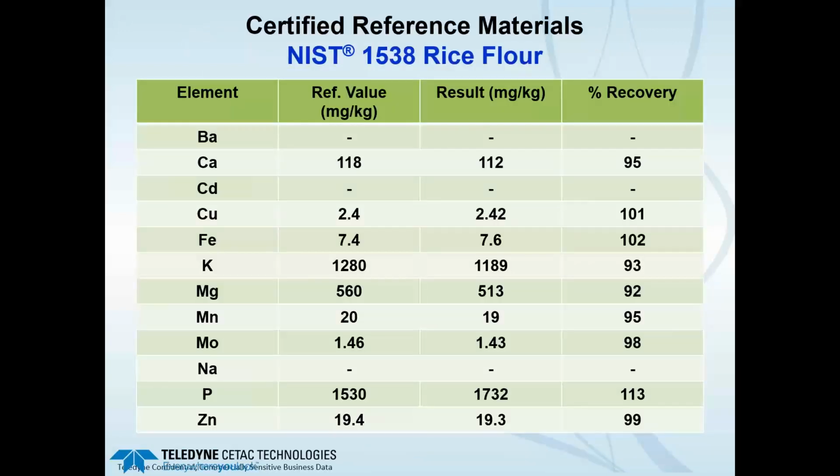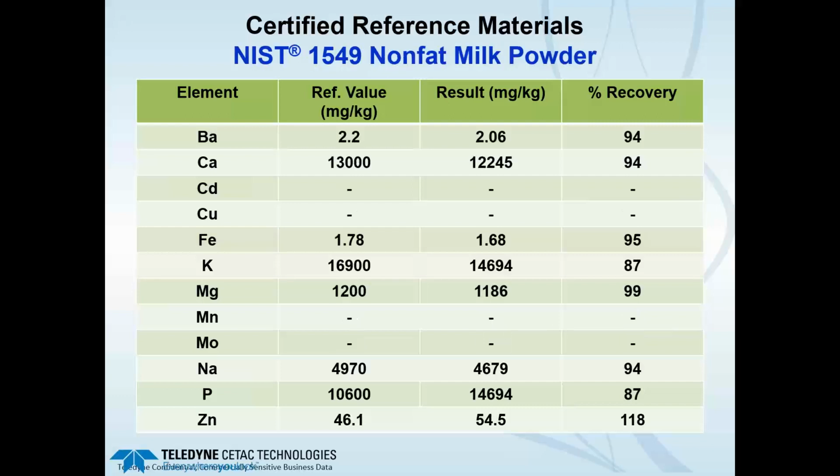Then in the rice flour, again, for the elements that we could detect at the levels that we could detect, we're getting very good recoveries within the 80 to 120% range. And then finally, also in the non-fat milk powder.